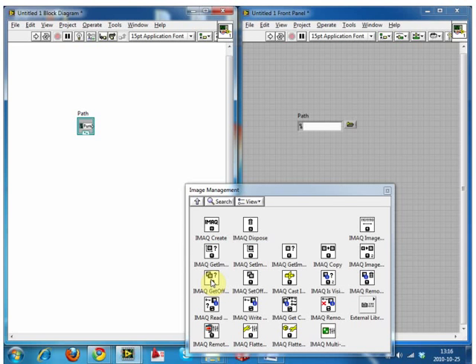Yeah? Ilona? Yeah, kind of. A little bit different, but it's the same. You're clicking around. I just want to make sure we're on the same page. Yeah, a little bit different click, but it's okay.